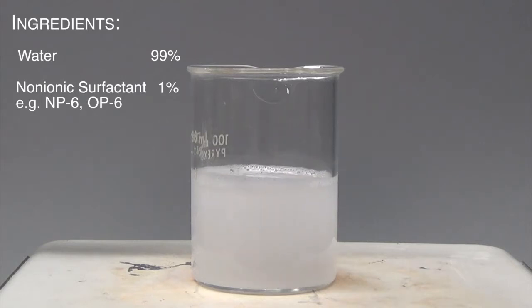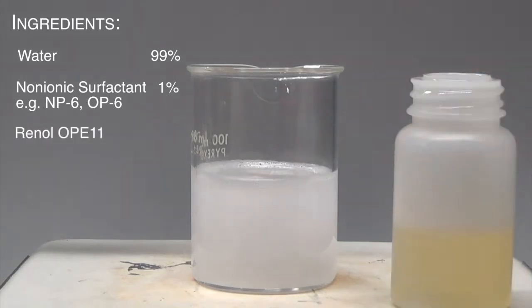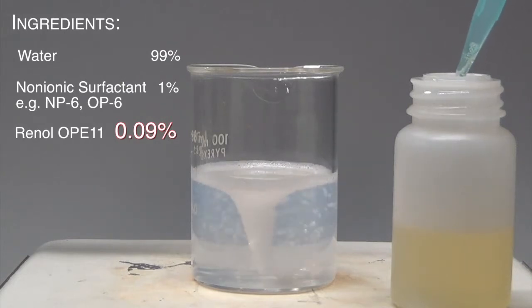At room temperature, the solution appears cloudy, meaning the surfactant is not soluble in water. We start adding Renol OPE11 one drop after another, observing the solution become clear. It takes only about 0.1% of Renol OPE11 to clear out the solution.